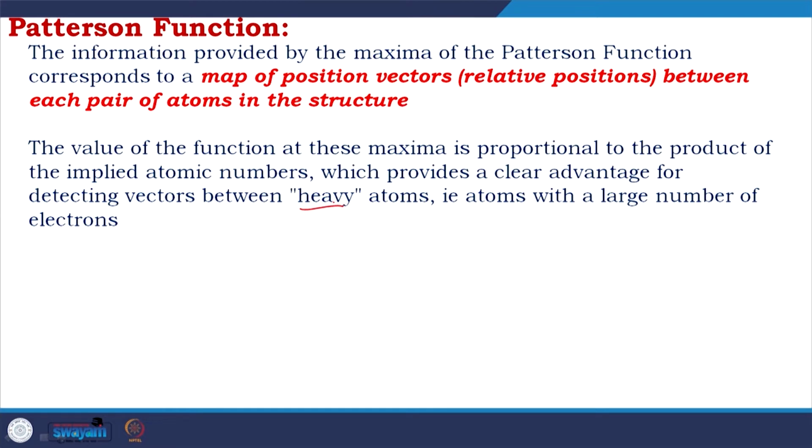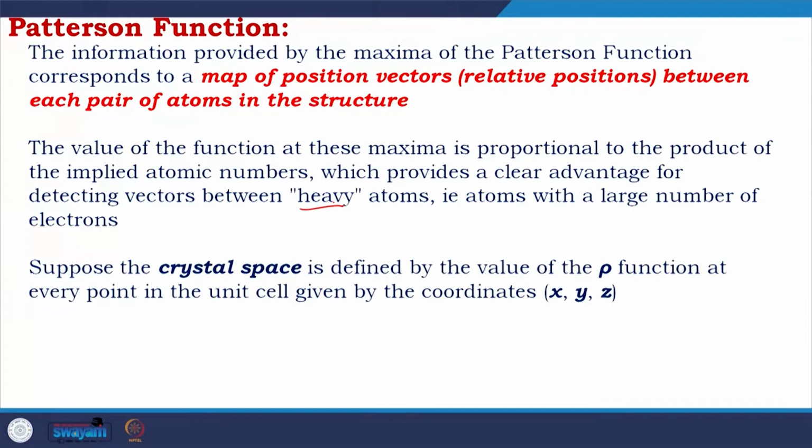We will again discuss this, but you could easily now understand carbon, nitrogen, oxygen. Now, if you include transition metals, mercury, gold, platinum, you have a lot of electrons, and that gives a lot of intensity, because in this method intensity plays a huge role. The scattering, where you have importance of the number of electrons.